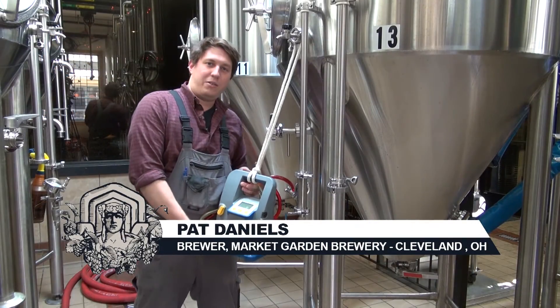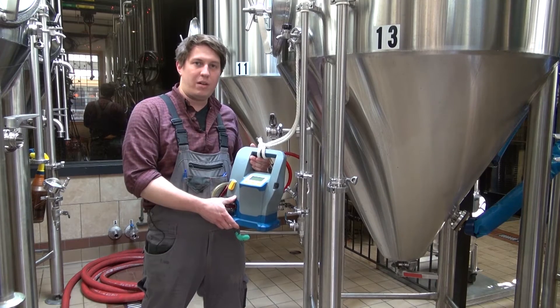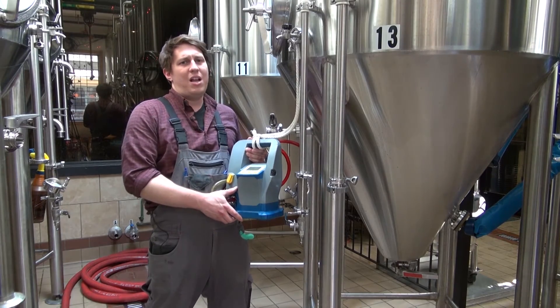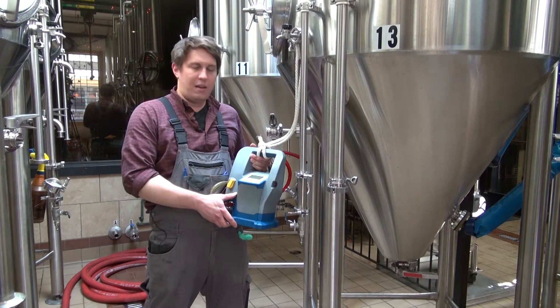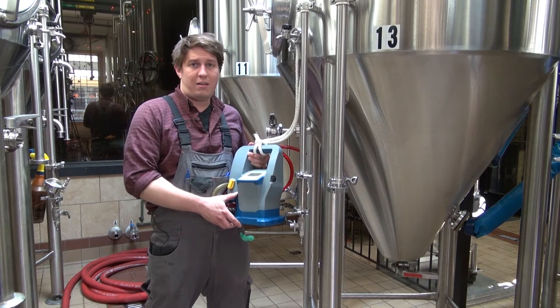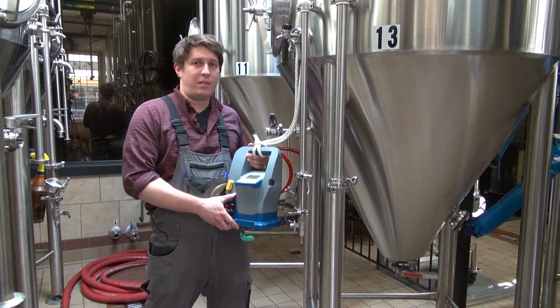This is Pat Daniels here with Market Garden Brewery in Cleveland, Ohio. I'm standing here with our Hamilton Beverly portable DO meter from Gusmer, and this has been great, handy, and — did I mention — portable. We use it everywhere from the hot side in the brew house into the cellar and over in packaging. I'm going to give you a rundown of how this works and how it can make testing dissolved oxygen in cold beer, aeration of hot wort, and oxygen levels in the air when purging tanks easier. You'll find all sorts of uses for it around the brewery, so let's check it out.